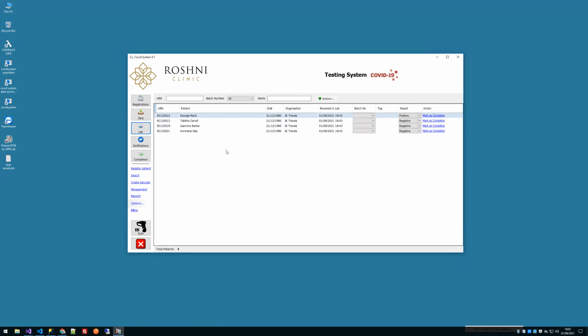Now they use different equipment, and what they've said is we don't mind manually entering some data in here. Some of them use the pooling system, and some of them said, okay, you know what, we don't mind. This can be batch 1. Or they might call it 01, 02, and so on. So for that purpose, I've not linked this with the machine itself, just because there's differences in how they operate, basically.